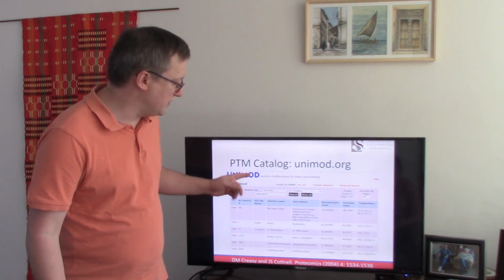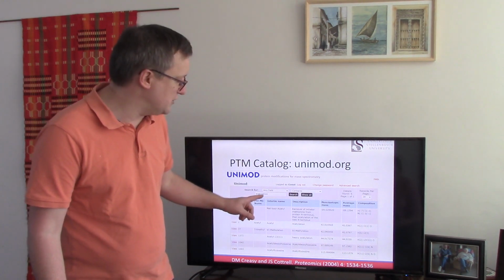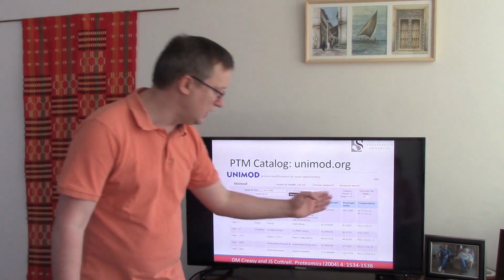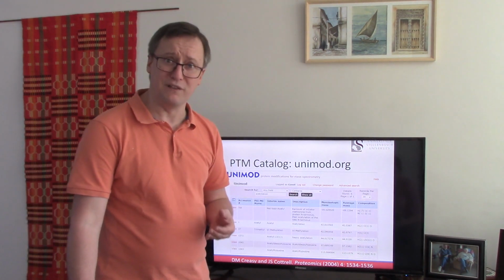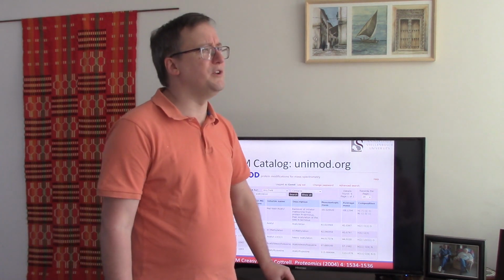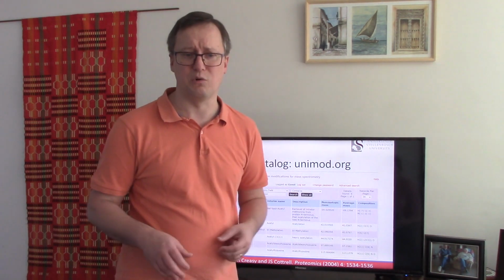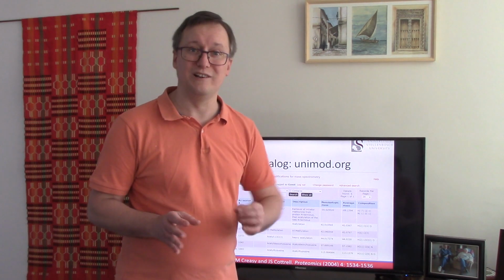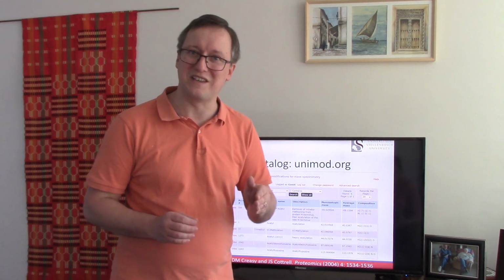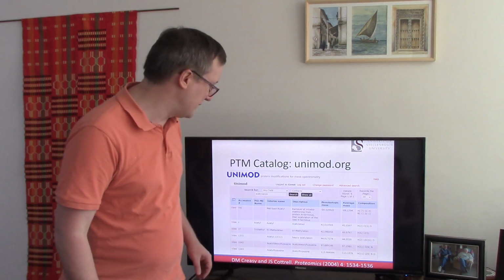The UniMod resource is really helpful in that you can simply write in the modification you're looking for, click Show All, and up pops a list. You'll frequently find that you get many hits on one of these. If you, for example, knew that somebody included a plus 57 in their Sequest search and you wanted to understand what that was about, you could just type 57 in here and say Show All. But I tell you, anything that includes the digit 5 followed by the digit 7 is going to show up in that search. So the search engine's a little hinky on that score.